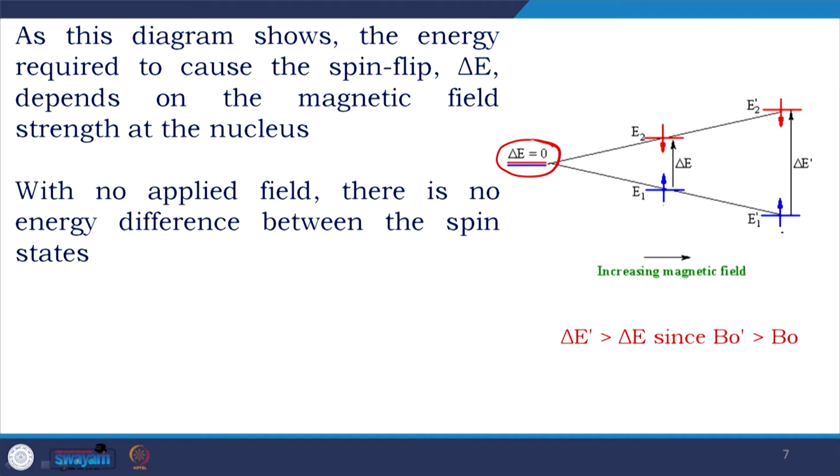But then as you start increasing the external magnetic field, there is a separation. When you apply, let us say, x amount, it is del E.